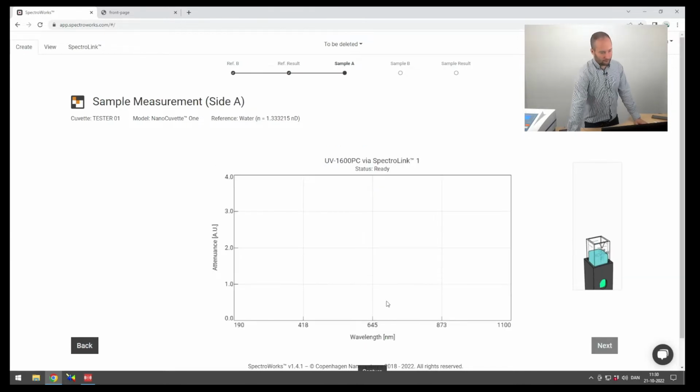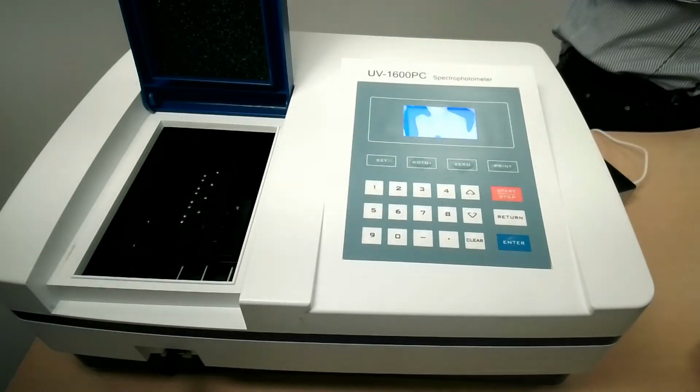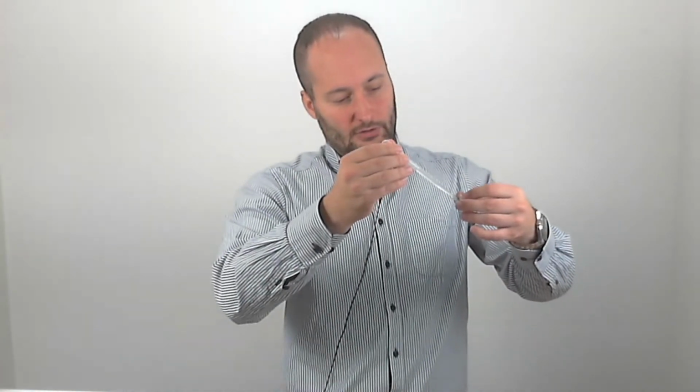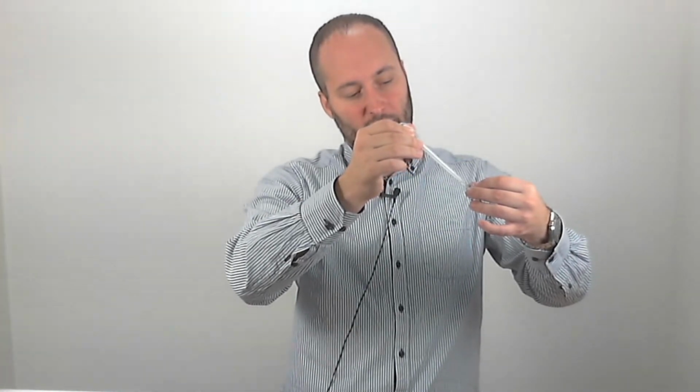Okay. Good, then we will take the sample, so I'll just do this. I'll not repeat all of what I was saying because it's the same as before. And of course, whenever you do experiments, you should start at low concentration and then move up, because you run the risk of sugar residuals or other stuff contaminating your sample. So when you do a dilution series, you should start with the lowest concentration and work your way up. That's what I recommend to everybody.